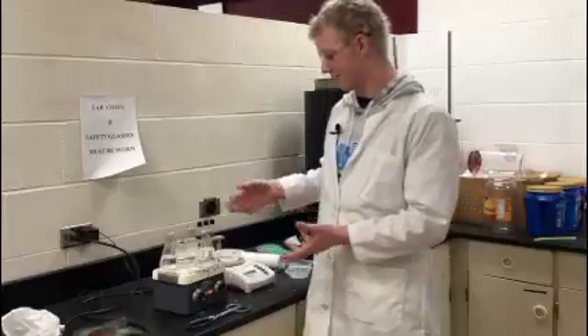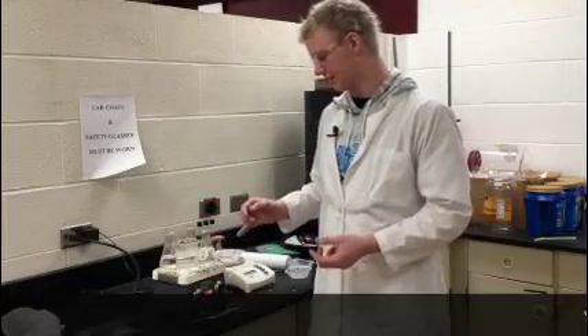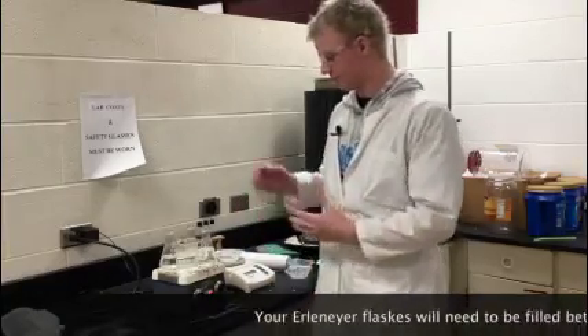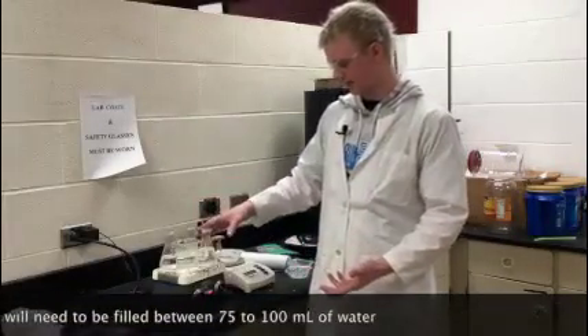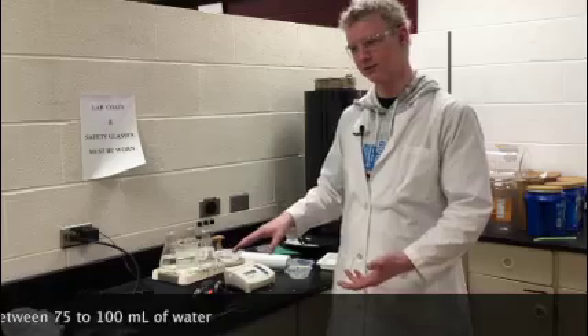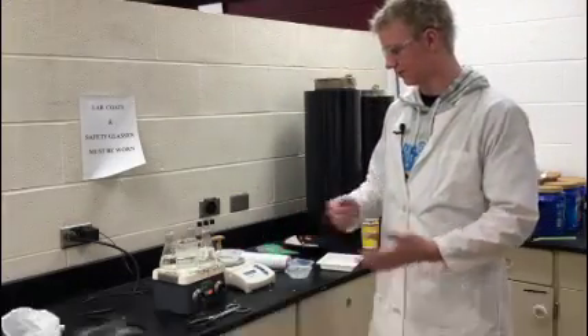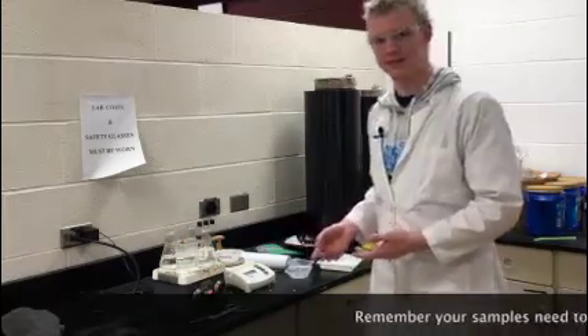As you can see, I have three Erlenmeyer flasks and a beaker. The beaker is for extra water just in case the water in the flasks gets below the 75 milliliter mark, so we can keep it topped up. Now we're going to start massing out the samples.